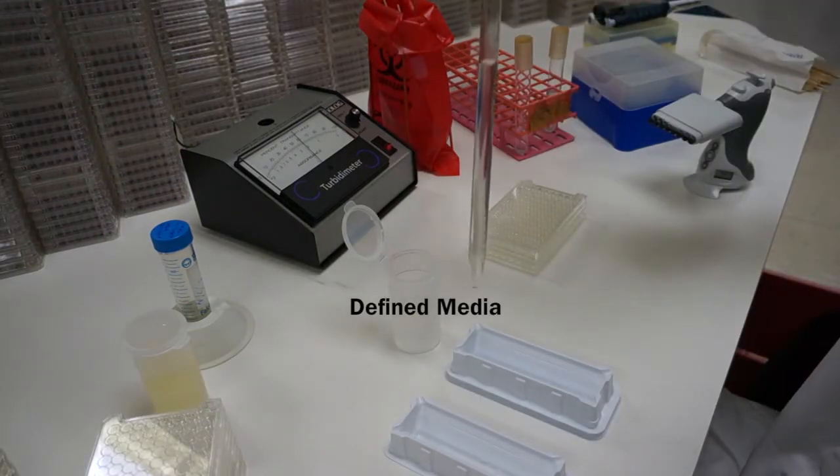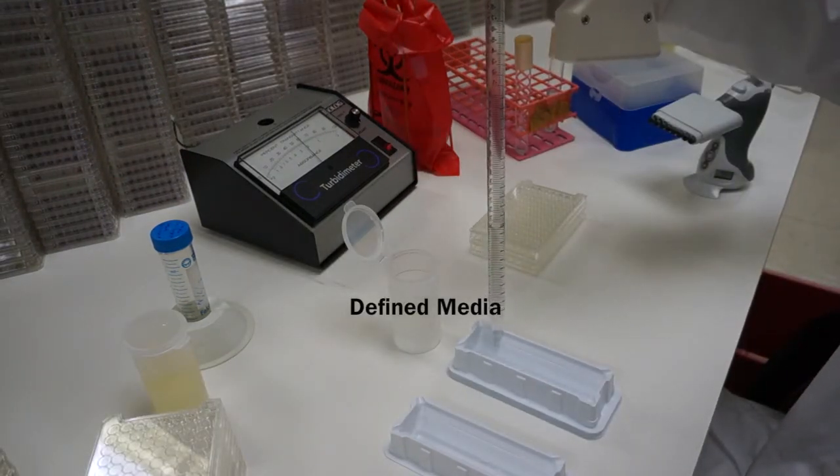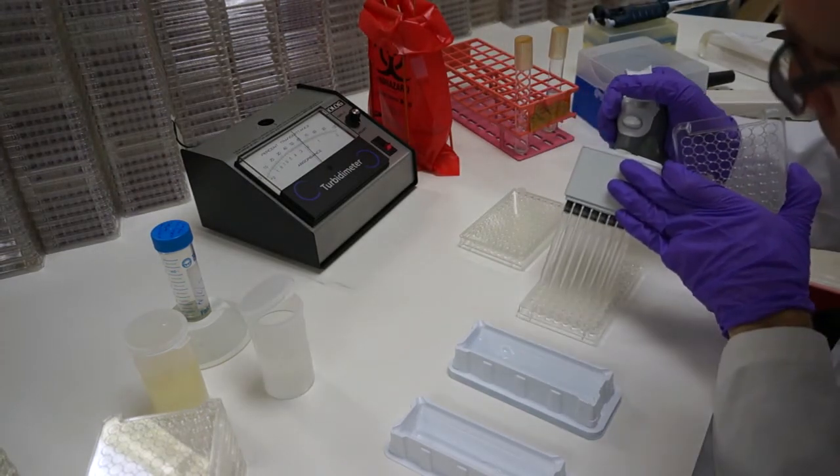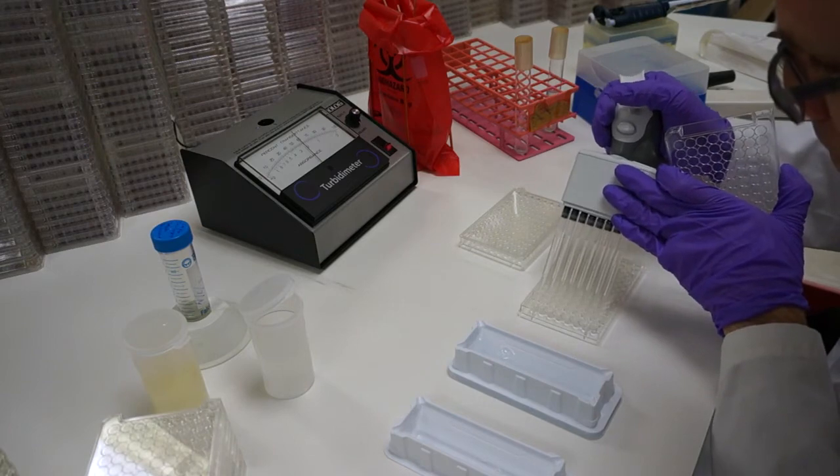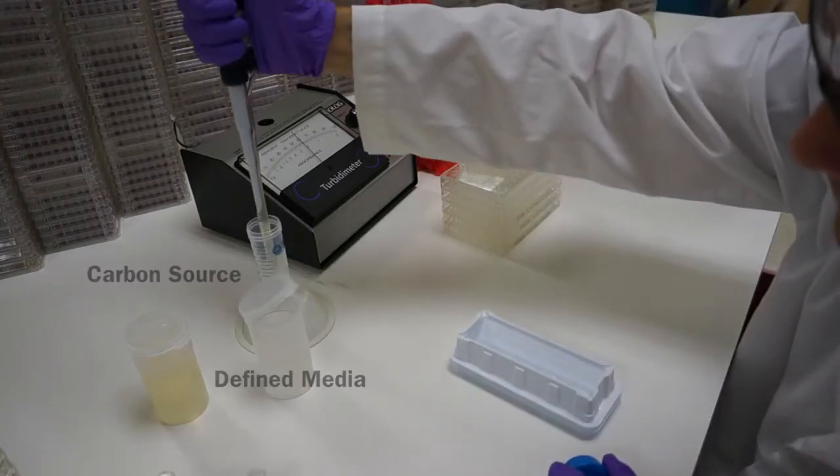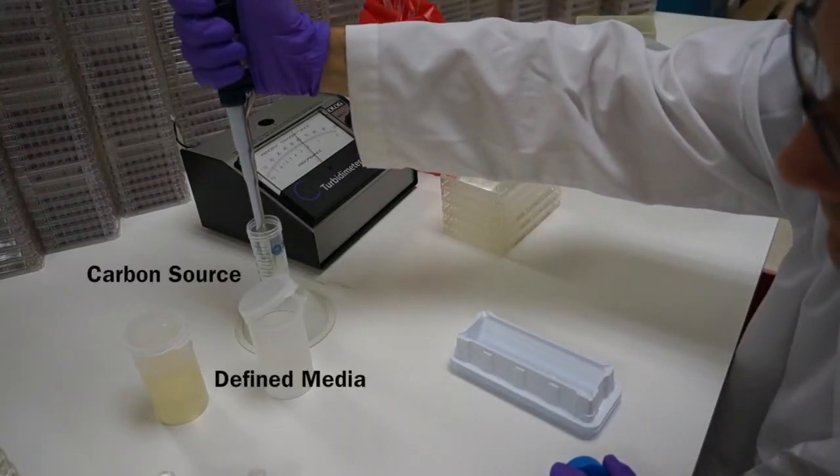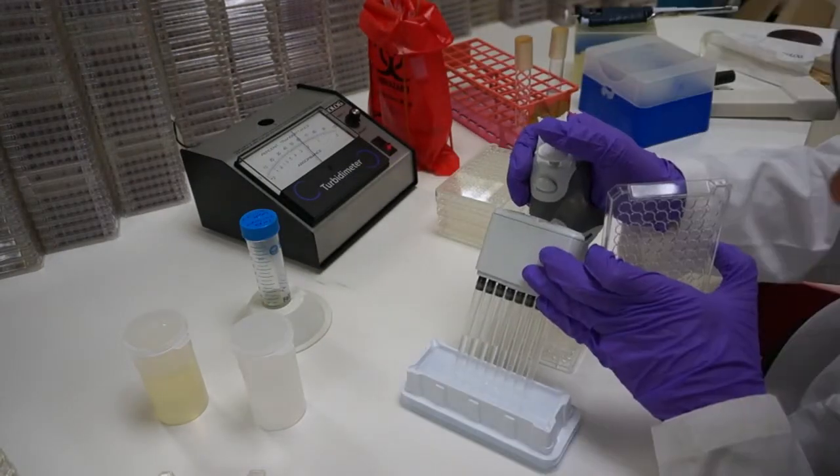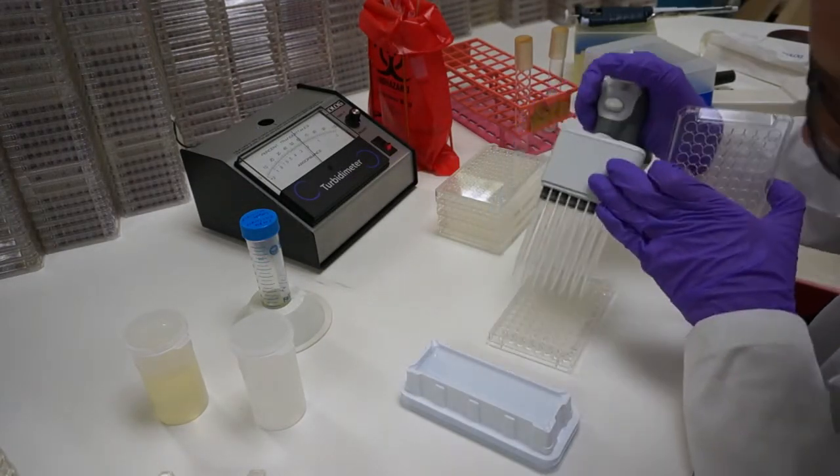Retrieve your original defined media suspension and fill PM microplates 1 and 2. Lastly, add a carbon source to the remaining defined media and dispense into PM microplates 3 through 8.